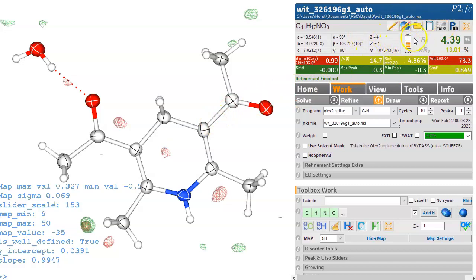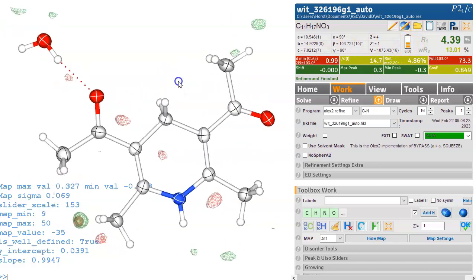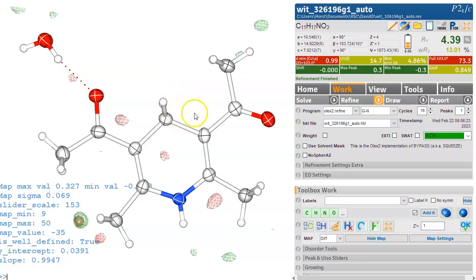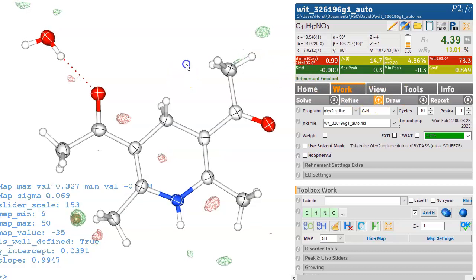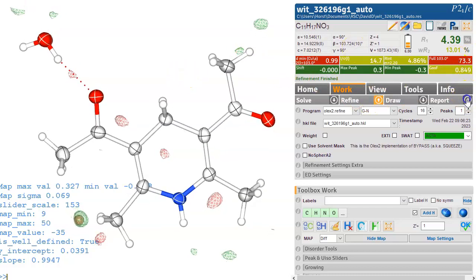So I think we can just leave it as it is so this is basically done yeah so we've got quite a low data parameter ratio is only six so that's also another reason why it wouldn't be publishable but we know what it is I think there's no doubt about what this material is it's a good question where it came from but that's what it is.